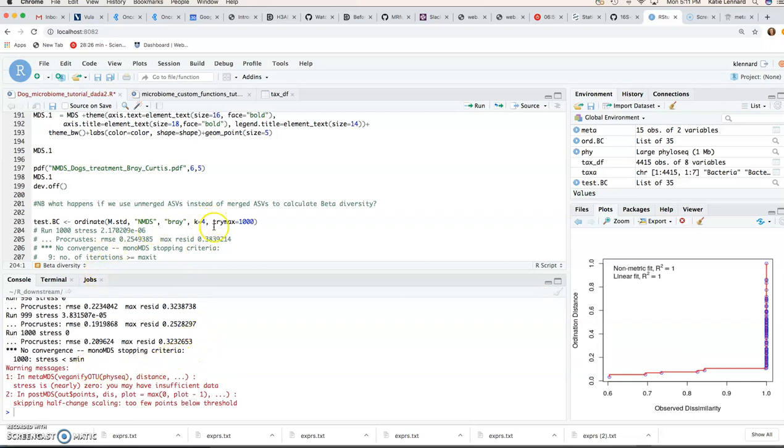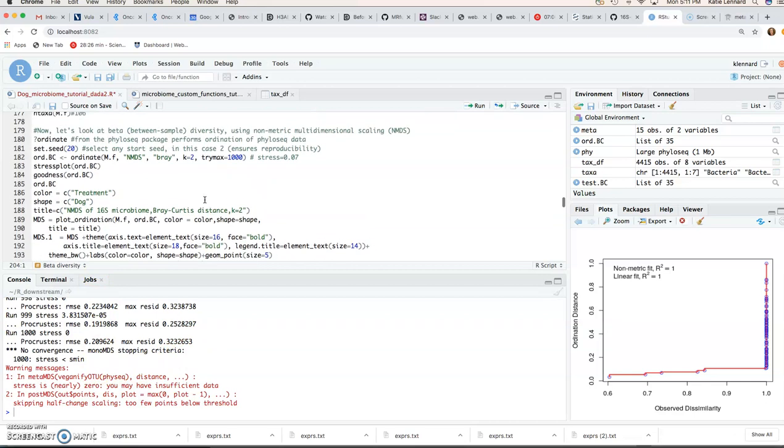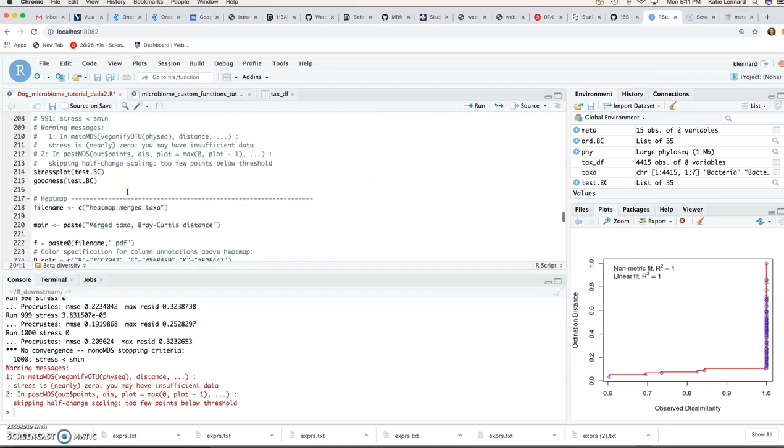So here it's really better for us to work on this biologically relevant ASVs that have been collapsed down to their lowest available taxonomic level.